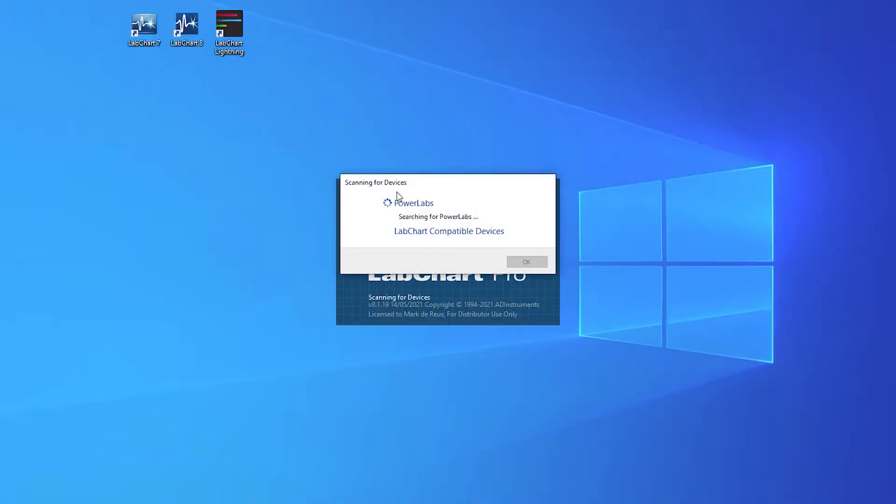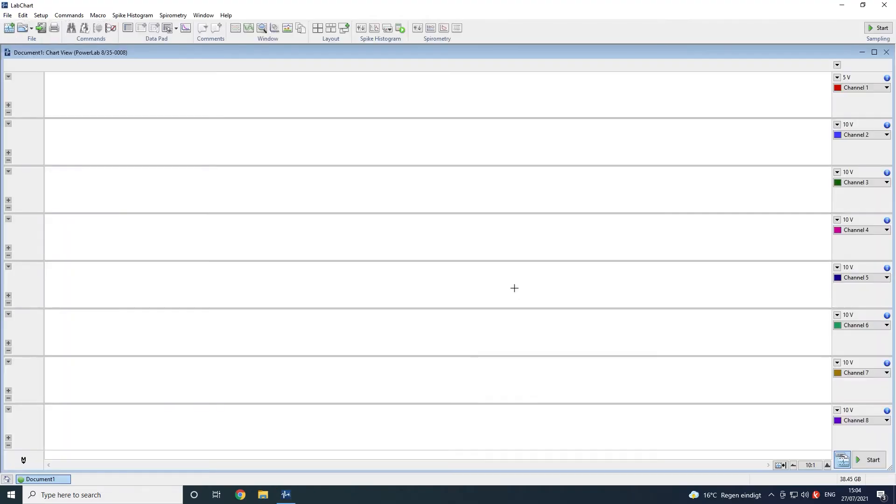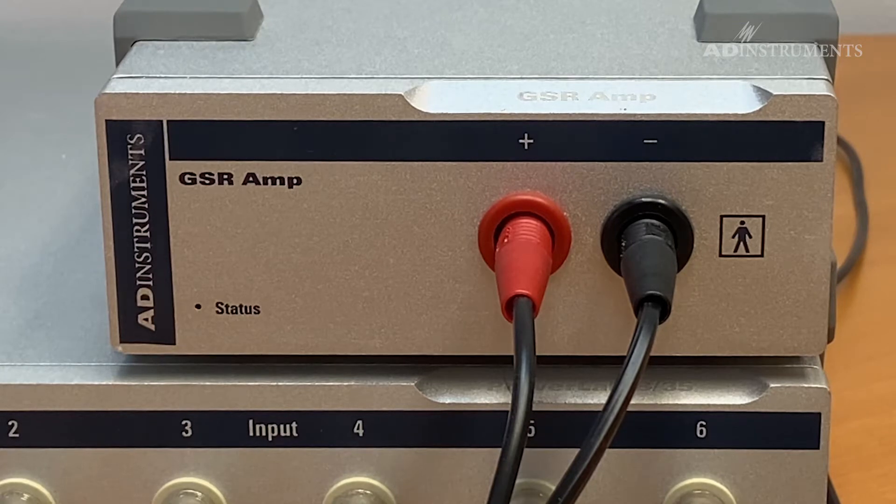Now start LabChart. When the GSR amp is correctly detected by LabChart, the status light will turn a solid green.